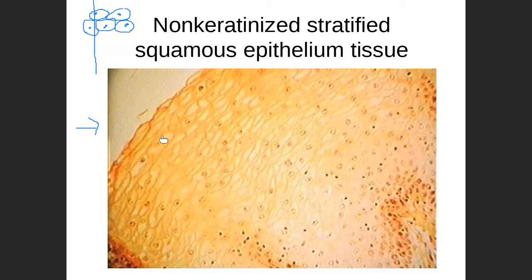But what I tell folks in most situations when they're not sure, look at the apical layer, the top layer here of our epithelium. If you can see a nucleus in any of those cells, then it's assumed that you will have a nucleus in all the cells below it. Here's a nucleus here, here's another one here, there's another one over here, all right? So all these cells, their nuclei are either to the left or the right of the slice, in front of it, behind it, wherever, okay? So, it's kind of a long explanation here, all right? But this is the non-keratinized stratified squamous epithelial cell.